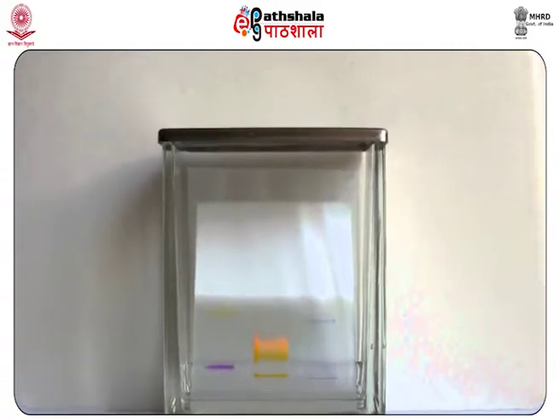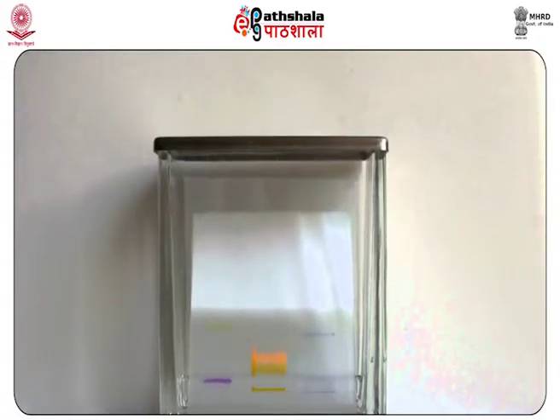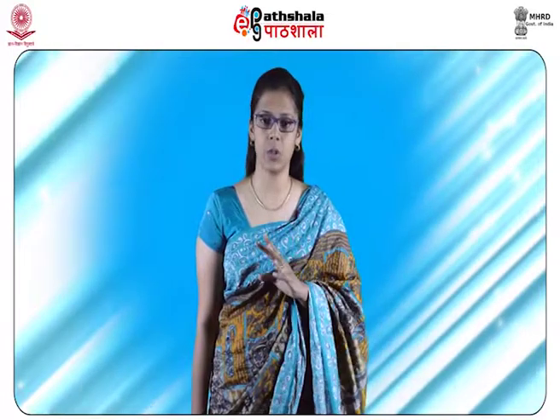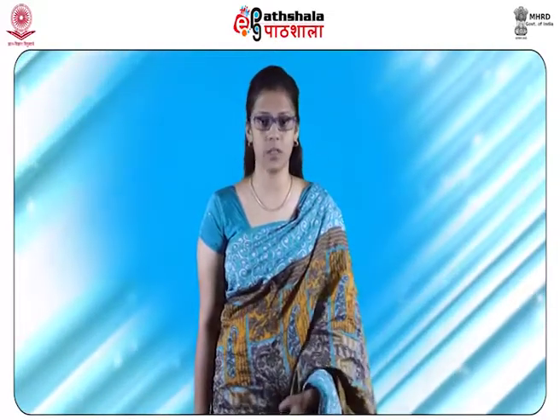After the plate is kept covered in the chamber, the level of eluent should be lower than the spots applied on the plate. Capillary action will take place as the eluent travels up the plate. As the process completes, the separation of the components can be observed.